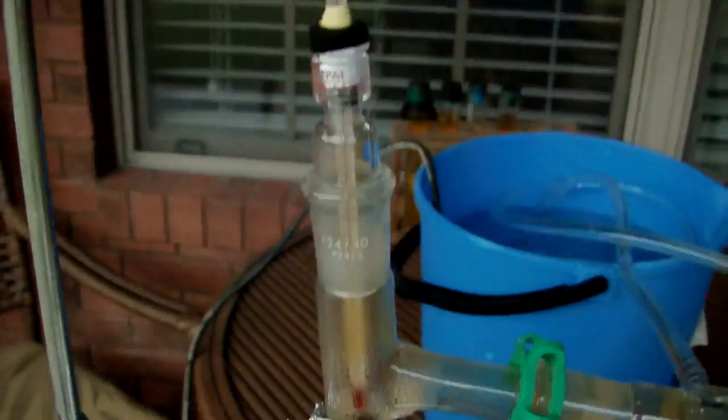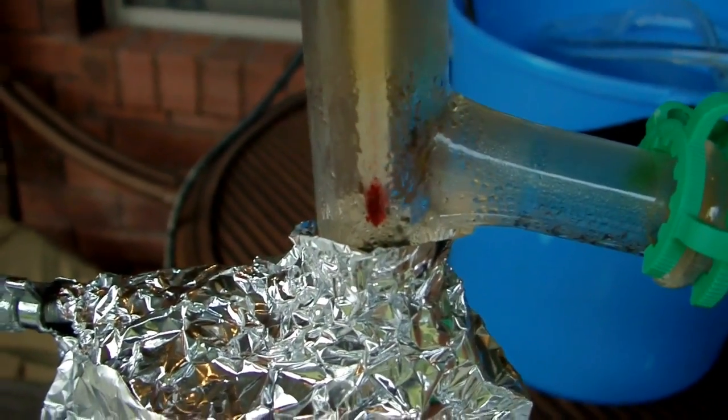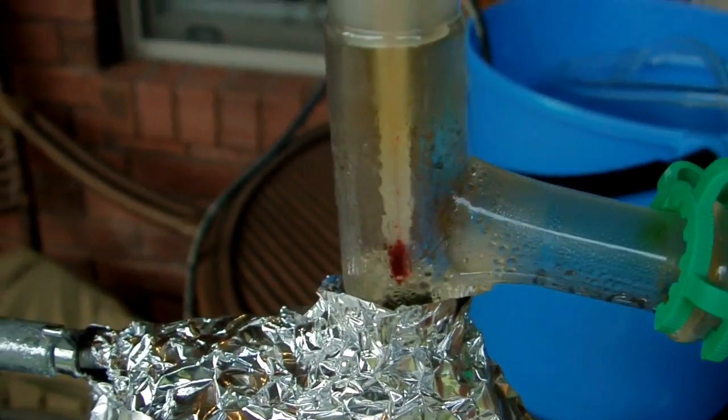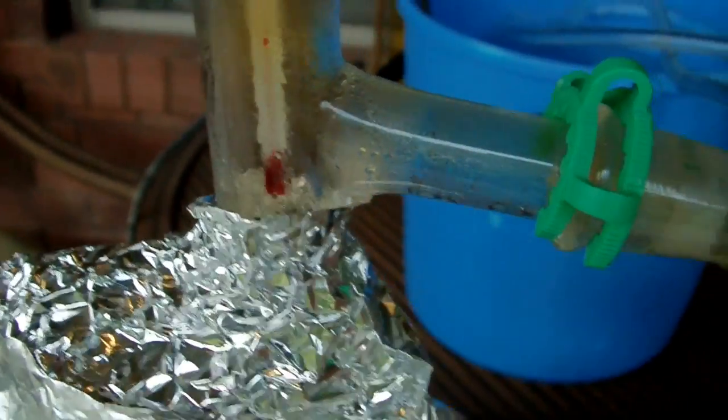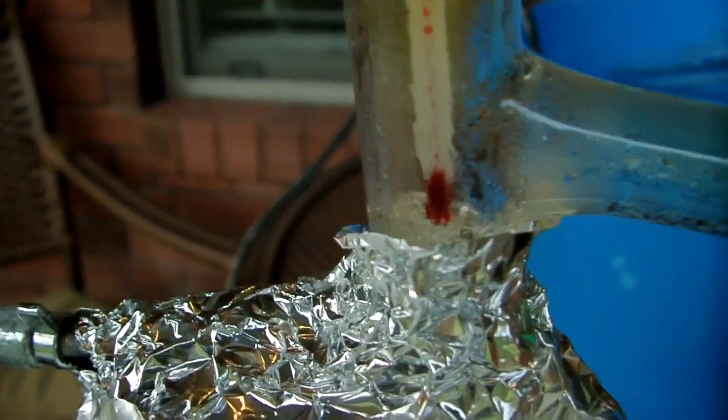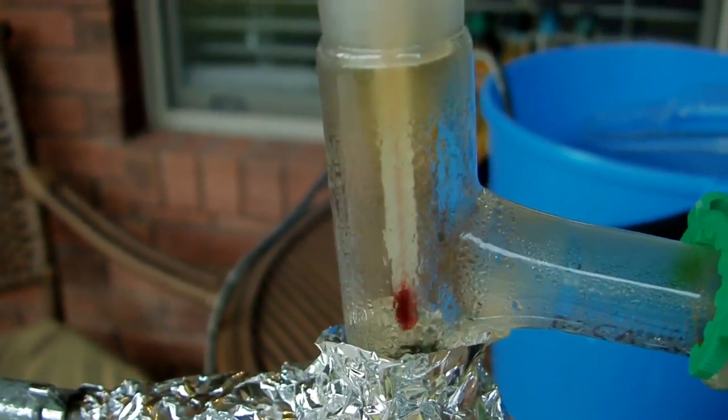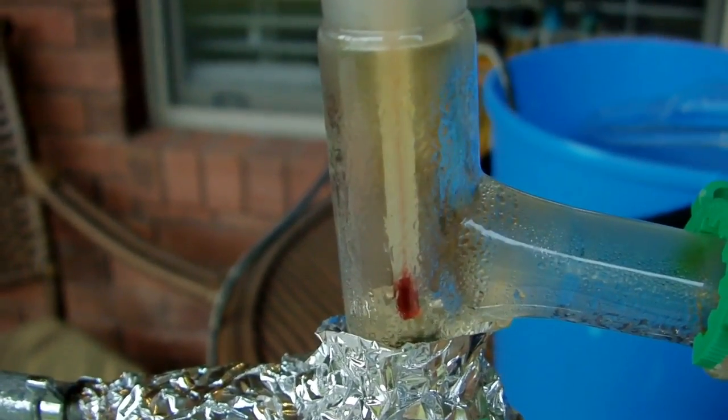So you can see inside the still head here, we get a nice brown coloration. And you can see some of the acid condensing and dripping back down. So it looks like we're about to get our first couple of drops of product. Right inside the distillation head there, there's a little bit of fog floating around.